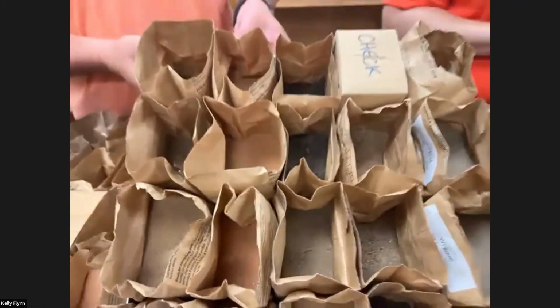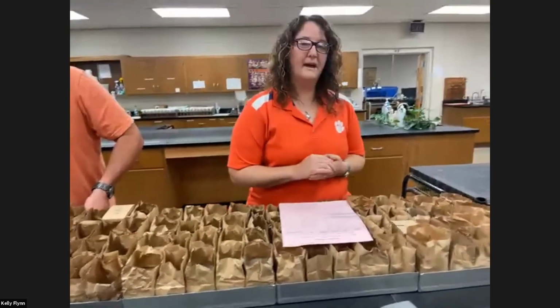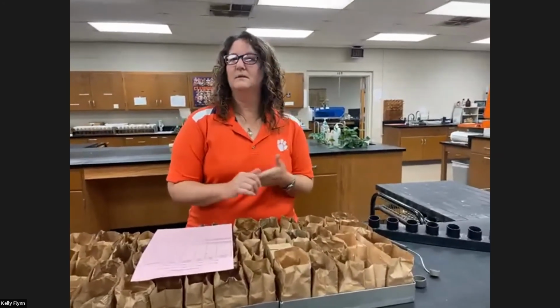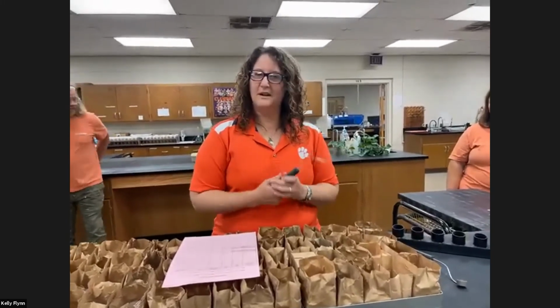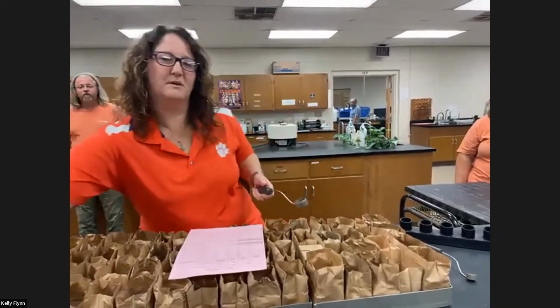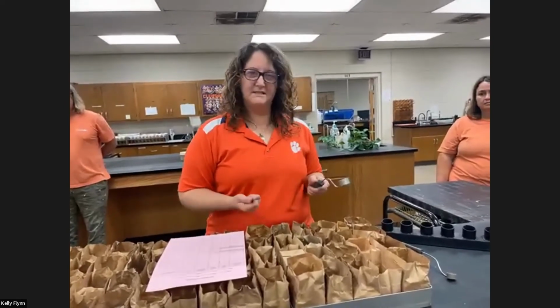So the first test is going to be our nutrient analysis. And for that, we're looking at the minerals that your soil contains. That would tell you potentially what fertilizer you might need to add depending on the nutrient content. We use these scoops, which are standard volume scoops. These are issued from some of those proficiency programs. So every lab that does this kind of work uses these kinds of pieces of equipment.